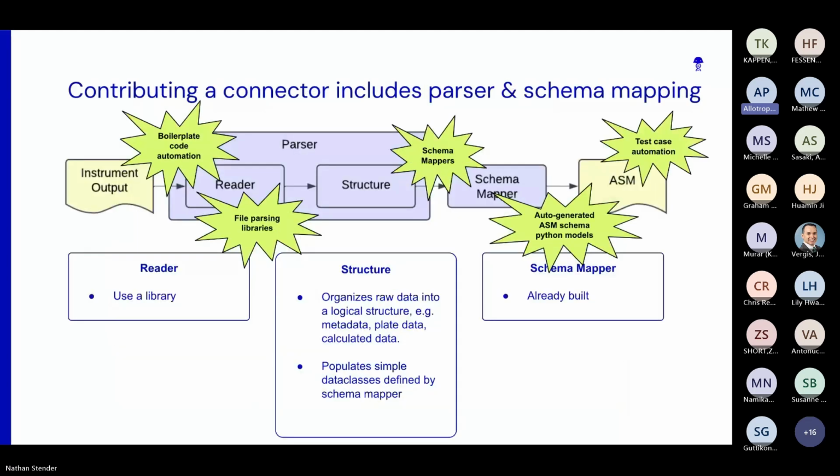So another look at this graph with these tools, you can see where each tool helps simplify this process. And if you squint your eyes, you can see that basically the goal here is to chip away at all of the repeatable parts on either side of the ontology mapping, and make it so that you have to do as little work as possible and just focus on the ontology mapping when you're writing a new parser.